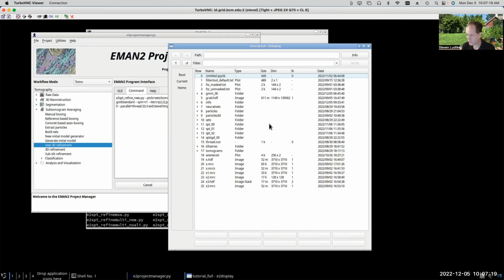So basically move your tomography data collection into something which is more like a single particle data collection where you're just doing some tilting. So don't use a 1 or 2 degree tilt step. Try and target maybe a 5 degree tilt step or even a 10 degree tilt step if you can get your software to do it. 5 is probably fine. And target a total dose over your tilt series of more like 60 electrons or something like that, and then anticipate that you might throw away some of the higher tilt images and only use, say, plus or minus 30 range or something like that. These are the sorts of things that you have to do if you're going to target high resolution when you're using these techniques.